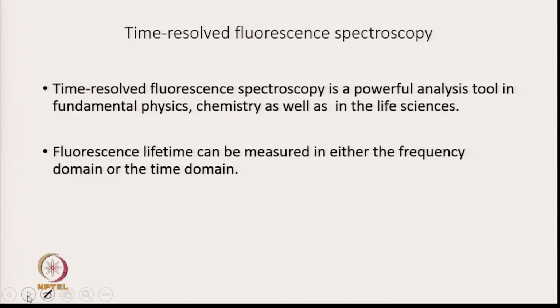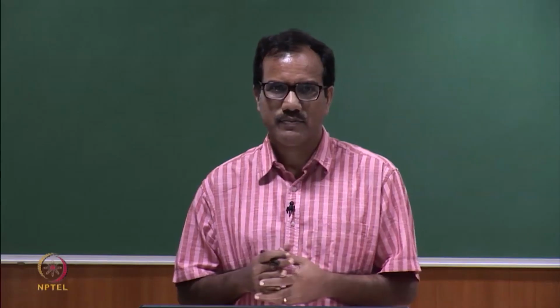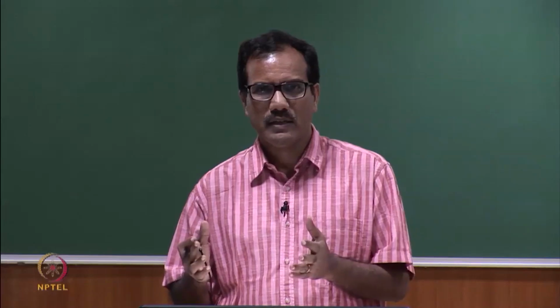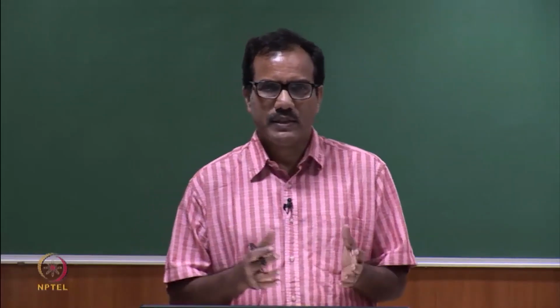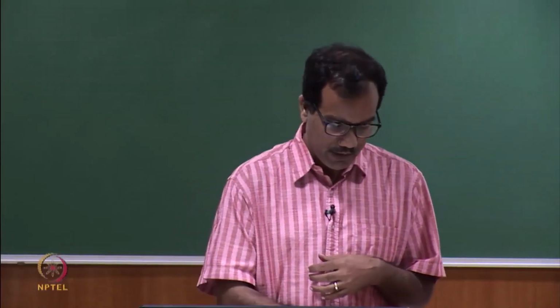So, time resolved fluorescence spectroscopy is quite a powerful analysis tool in fundamental physics, chemistry as well as in the life sciences. Now, how to measure the lifetime? It can be done in two ways. Lifetime measurement can be done either in the frequency domain or the time domain, and I have already discussed what is the difference between time domain spectroscopy and frequency domain spectroscopy.